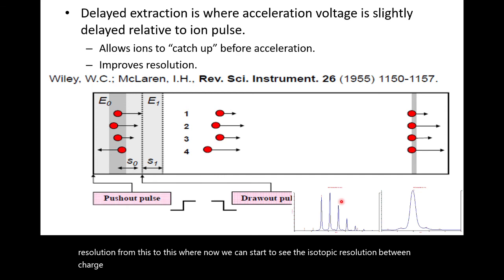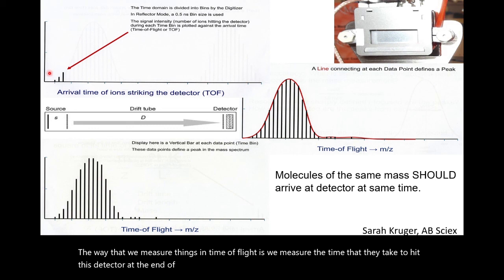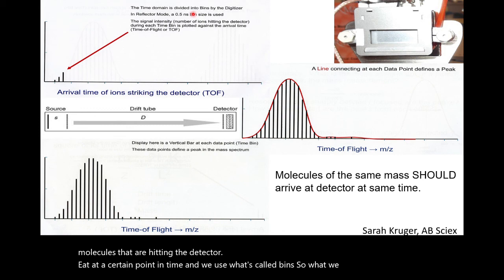The way that we measure things in time of flight is we measure the time that they take to hit this detector at the end of the flight tube. And so what we do is we measure the number of molecules that are hitting the detector at a certain point in time, and we use what's called bins. So in this case, we measure for half a nanosecond how many ions hit the detector.